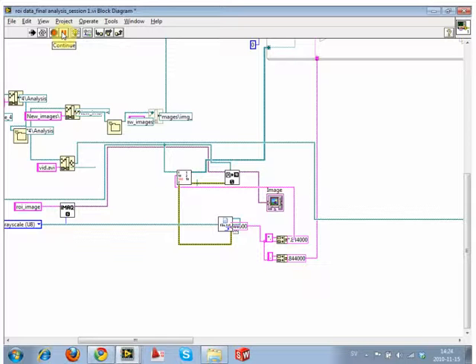Where? So, yes, Dr. Jeffrey. If you actually look at this, what's this thing supposed to do? It's supposed to tell us the file extension. Exactly. And what's it outputting? The output of the extension. So the file's extension is .844.000. The what? So the file extension should be JPEG, TIFF, bitmap, right? But what is it?